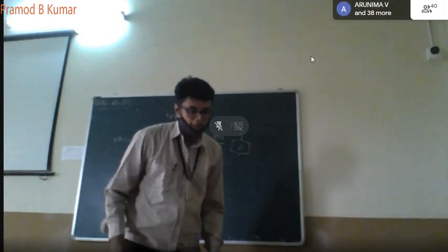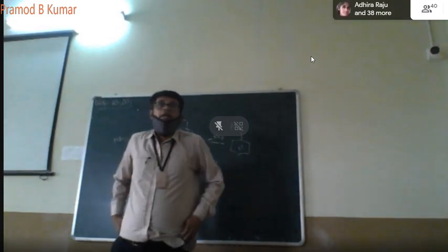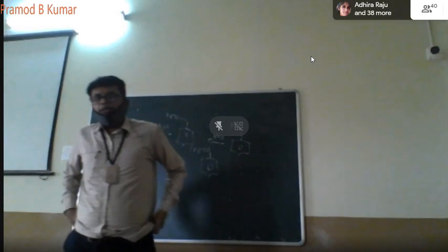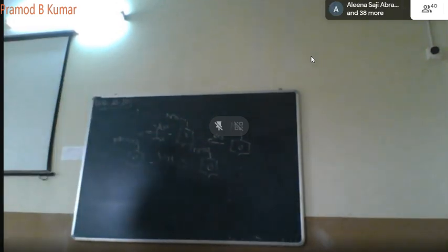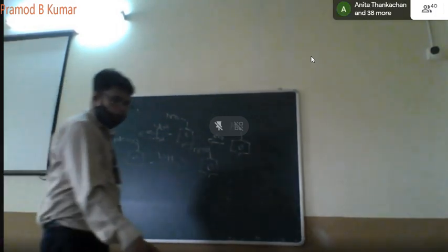This reaction is an example of oxidation. Right? Oxidation, and the oxidizing agent is KMnO4, potassium permanganate.